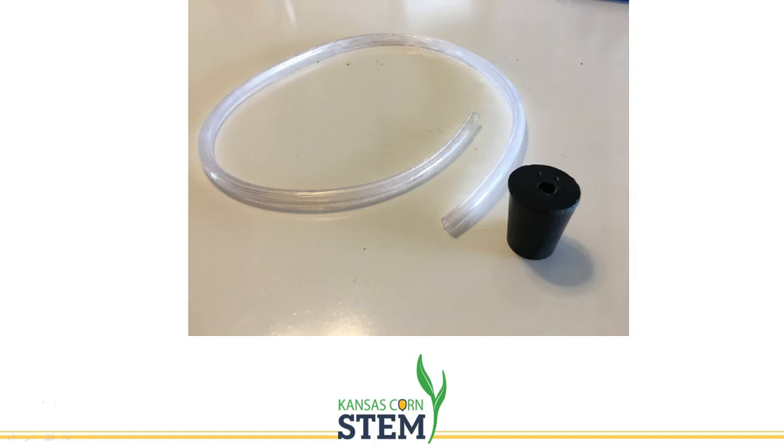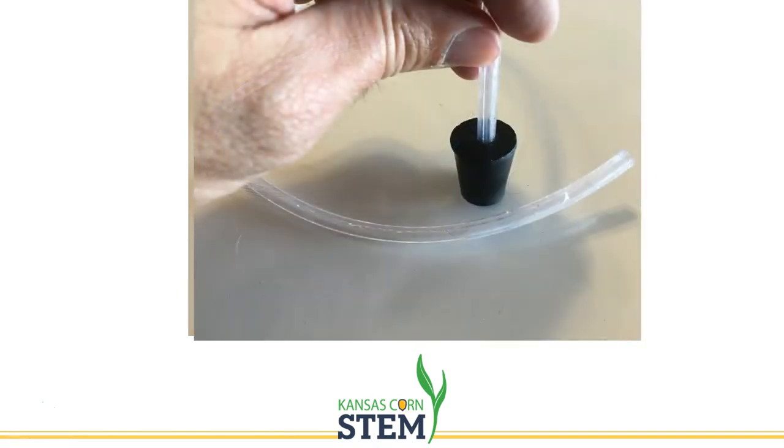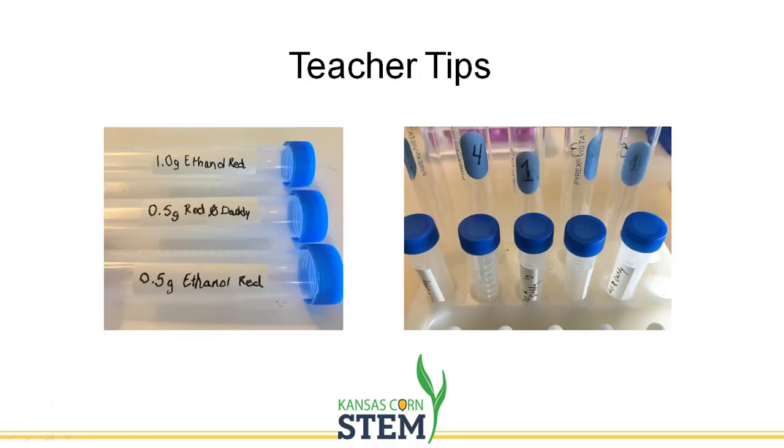Also in your totes, you should find 20 pieces of clear tubing. Determine the size of rubber stoppers you need to fit the test tubes you will be using, and then insert the tubing into the rubber stopper. If you have trouble fitting the tubing, use a pencil to widen the opening, and then try again. To speed things up on day 2, I have students pre-measure the amounts of yeast that they will be using in each sample, and store them in a 15 milliliter centrifuge tube. The next day they can just simply dump them in after they've used their serological pipettes to add their enzymes and buffer solution.